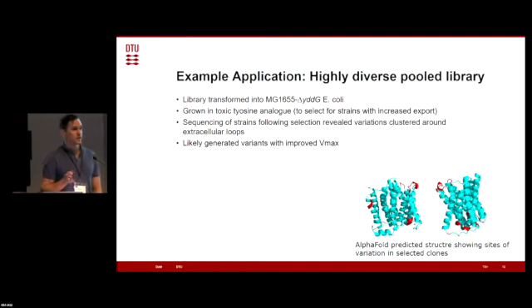I'd like to show you guys sequencing data. We may patent something, so I'm not allowed to, but I can give you the broad strokes of what we found. Basically, specific things became enriched when we did this selection assay. And again, I've got the nice AlphaFold structure here, and the red regions are the regions where we saw big divergence away from wild type.